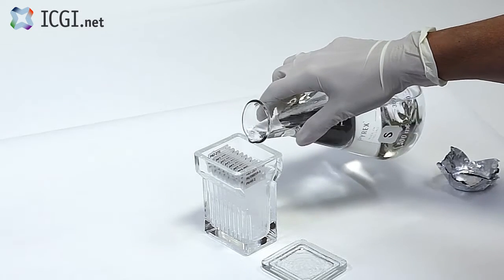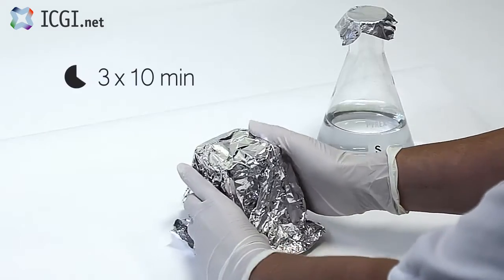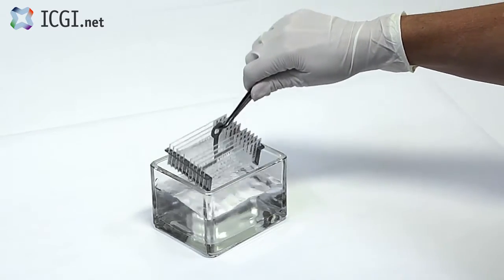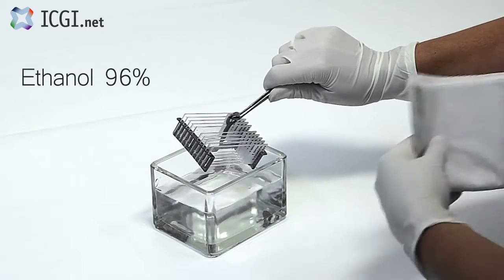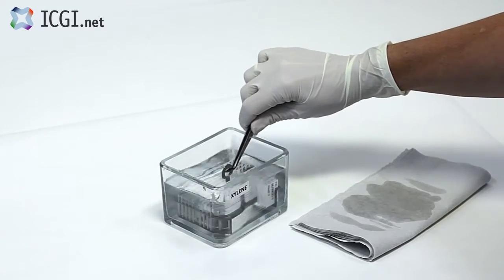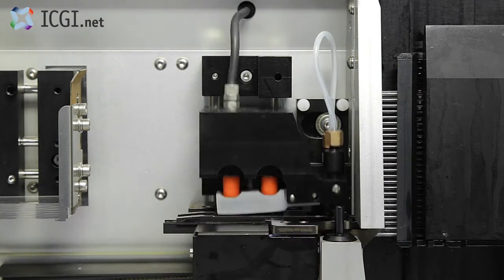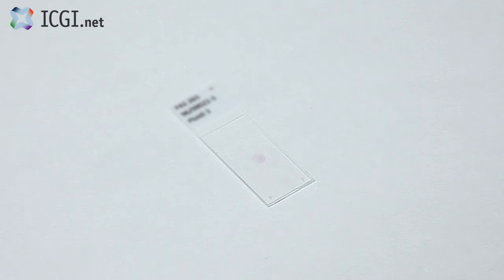Following staining, the monolayers are bathed in a 1 molar sodium sulfate solution. This is done 3 times for 10 minutes. The monolayers are then dehydrated with a series of increasing concentrations of ethanol: 70%, 96%, absolute, and absolute. After dehydration, the slides are dipped in concentrated xylene. Cover slips are applied to the slides. The monolayer is now prepared for digital imaging.